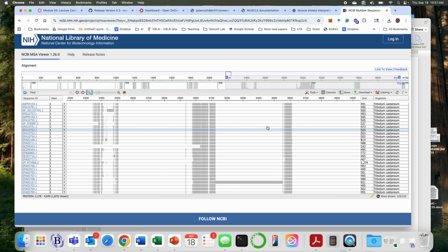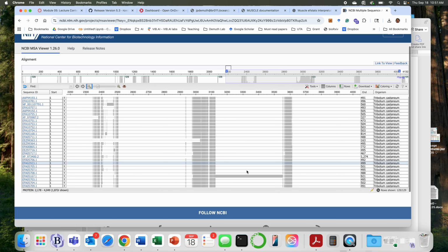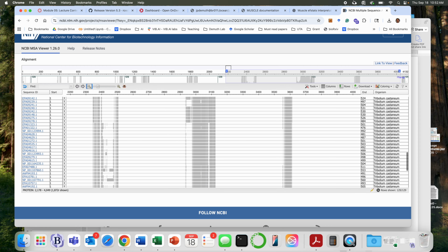That's why it had to insert this big gap here. And this is the real variation in the P450 gene family. These are a nightmare to align well. But that's real data. This is the kind of stuff you will see if you do this for a living. Or in your projects later in the semester.